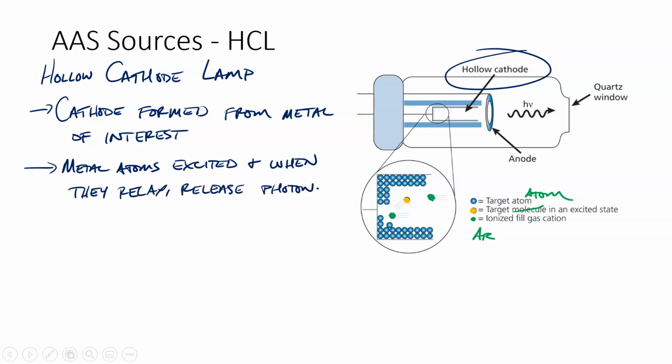So why use the metal of interest? Well, if we use a tungsten bulb, let's say that tungsten light bulb puts out light in a range from 300 to 900 nanometers, right? We've got 600 nanometers worth of light. Let's say that's 600,000 picometers. If we know that the bandwidth of our emission of interest, our transition of interest, is just 10 picometers, we're only using 10 out of 600,000 picometers of the bandwidth of that light source.